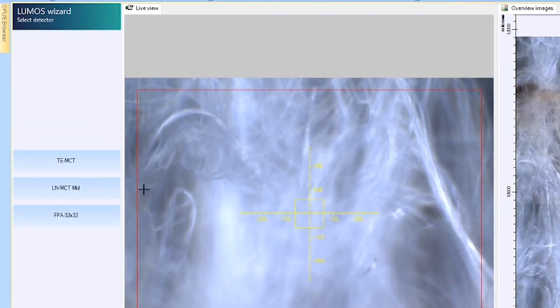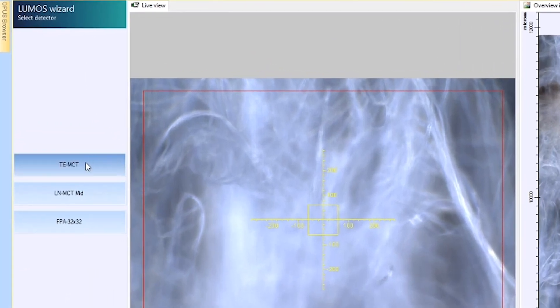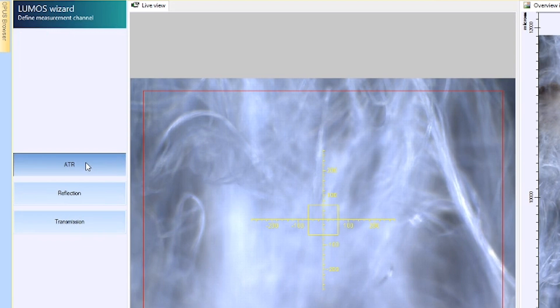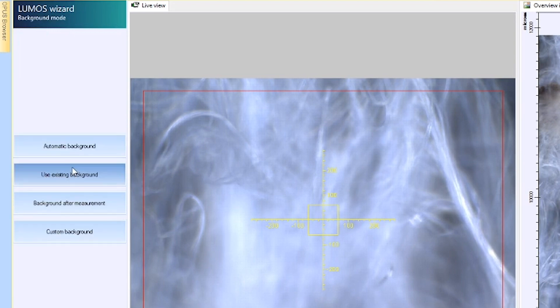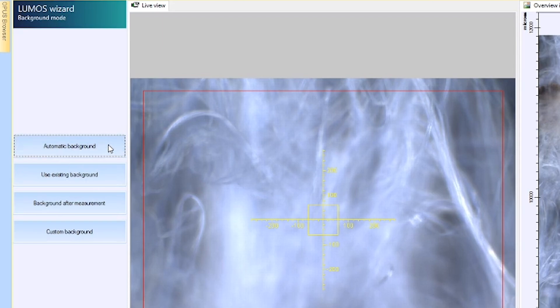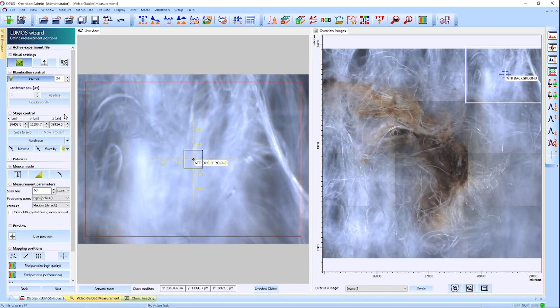Next, we go through some options to set up the experiment, choosing the measurement technique we want to use. For this measurement, ATR, or attenuated total reflectance, is the optimal measurement technique.